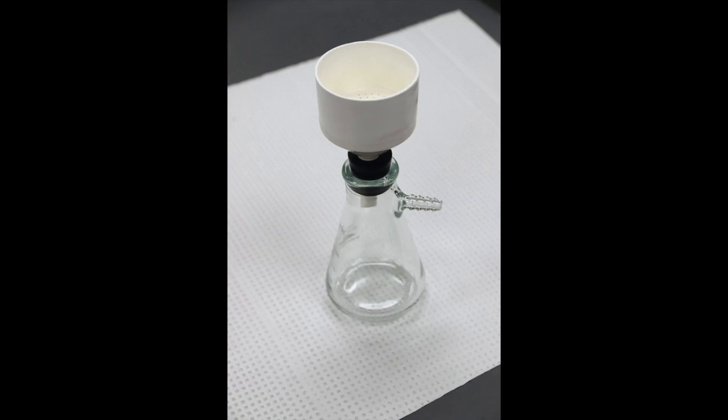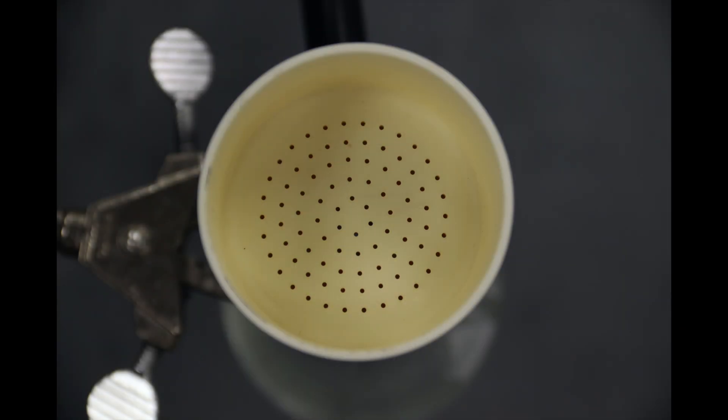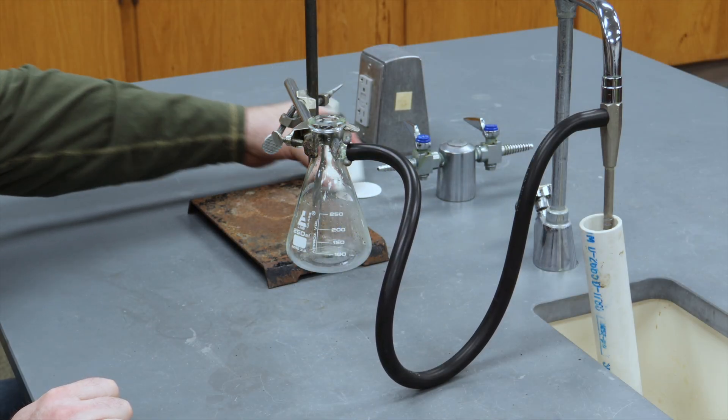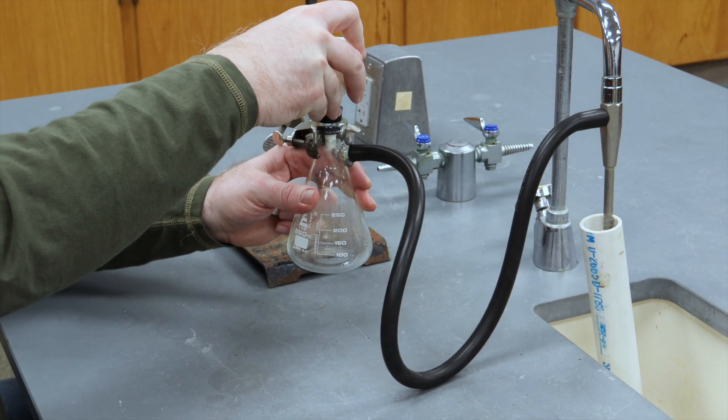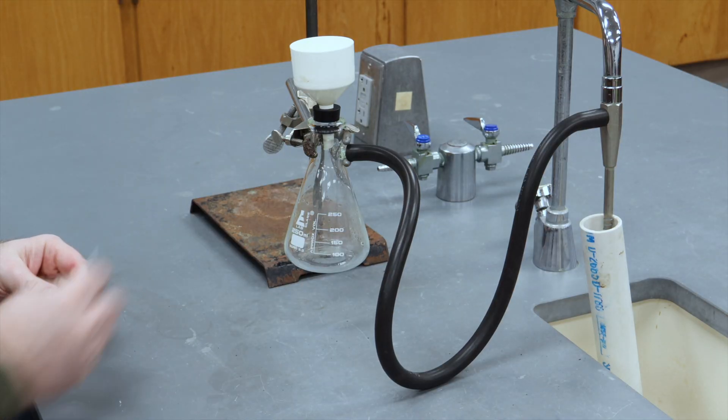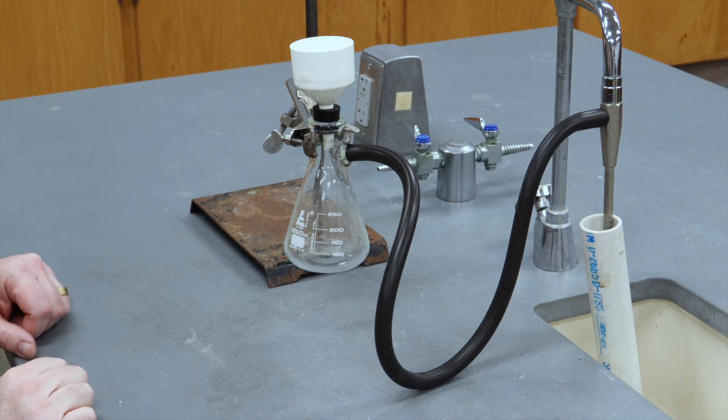The Buechner funnel has holes in it that allow liquid and air to flow through it easily. However, these holes are big enough to allow your solid compound to flow through as well. So, we'll need to use a perfectly sized filter paper to cover these holes.